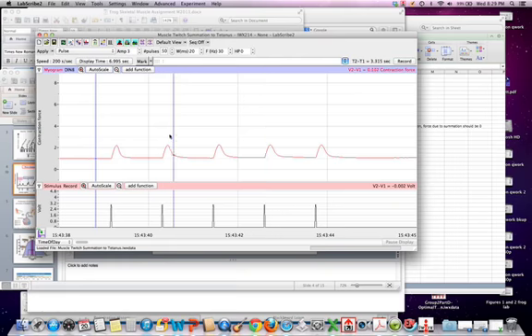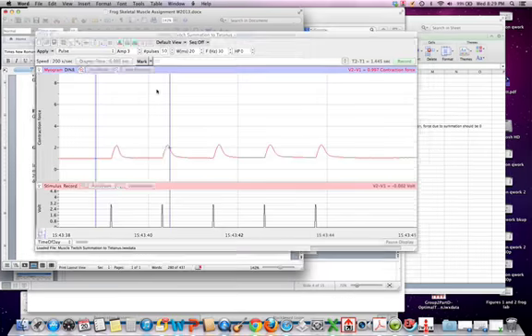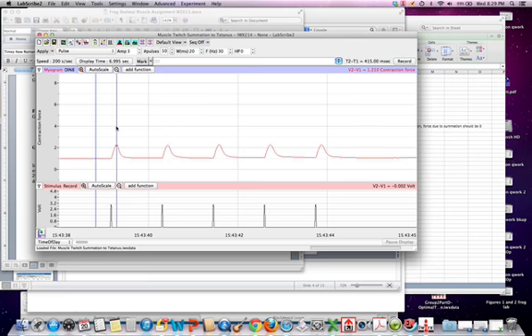So what you do not want to do in this case is measure the peak here. Instead, what you're looking for is any indication of summation that's occurring here. So the V2 minus V1 is showing a 0.107 amount here, which is a little bit of summation occurring there, but not very much at all. So there may be some summation happening here, but I'm not seeing it too much.